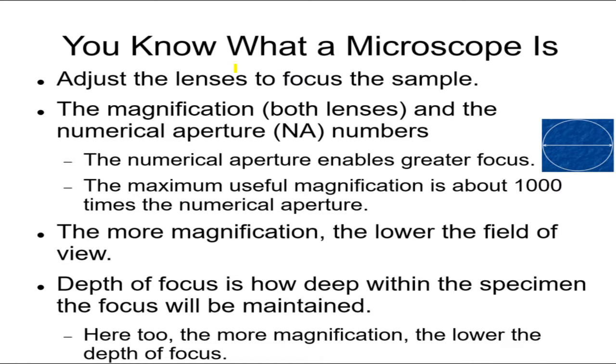Well, you know what a microscope is. It's that thing you put your eye in, you look through it, and tiny things become huge, right? You can see little tiny things. I'm not going to show you a picture of it, at least not yet. And you probably also know that you adjust the lenses of the microscope in order to make things bigger and smaller, and also to make sure it's very clear. Okay, fine. The simple stuff I'm not going to go into.